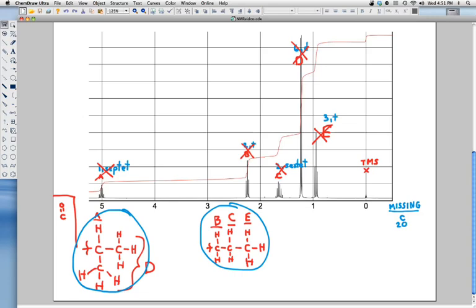And now what we need to do is take these missing atoms and turn them into pieces. And here's where we remember our IR. Our IR clearly showed that we have a carbonyl, so clearly these pieces are going to correspond to a carbonyl, and that carbonyl has 2 bonds associated with it, and then we still have a leftover oxygen. So let's draw that oxygen in, and of course that oxygen has 2 bonds as well. So here are 2 other pieces that we have.